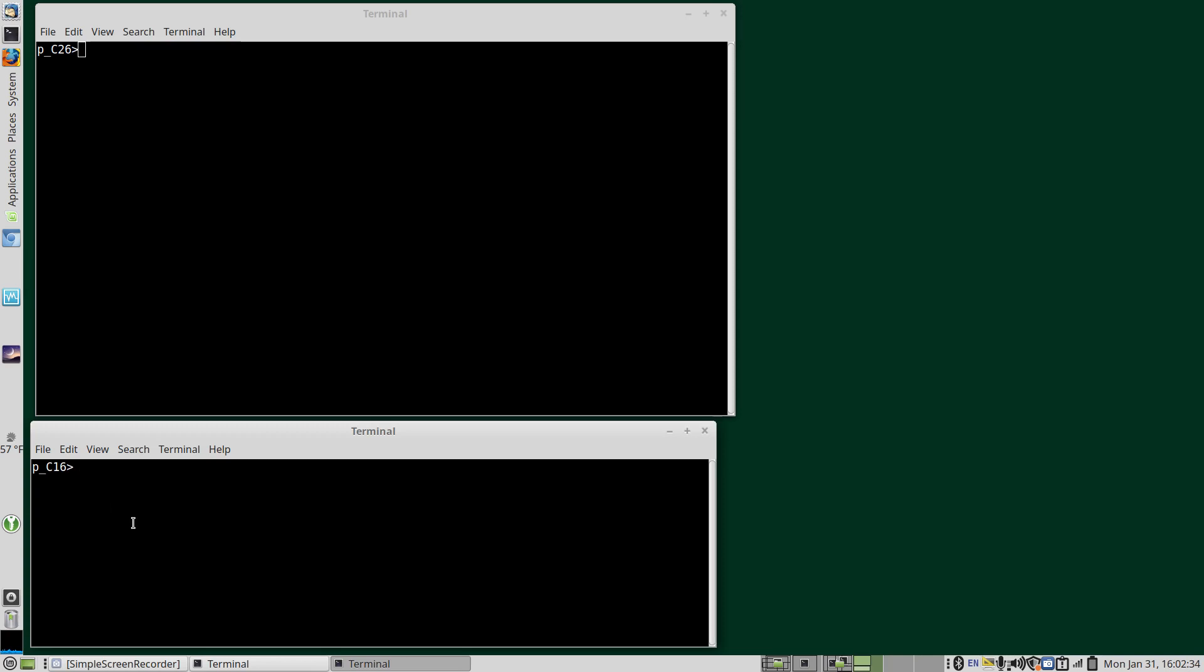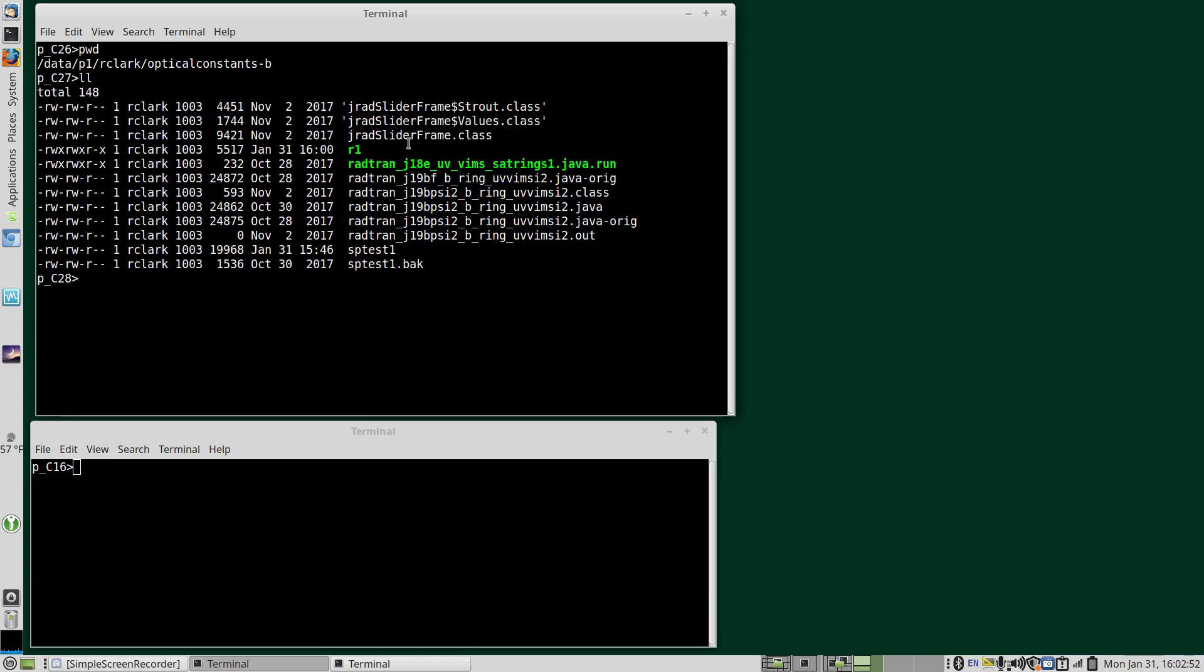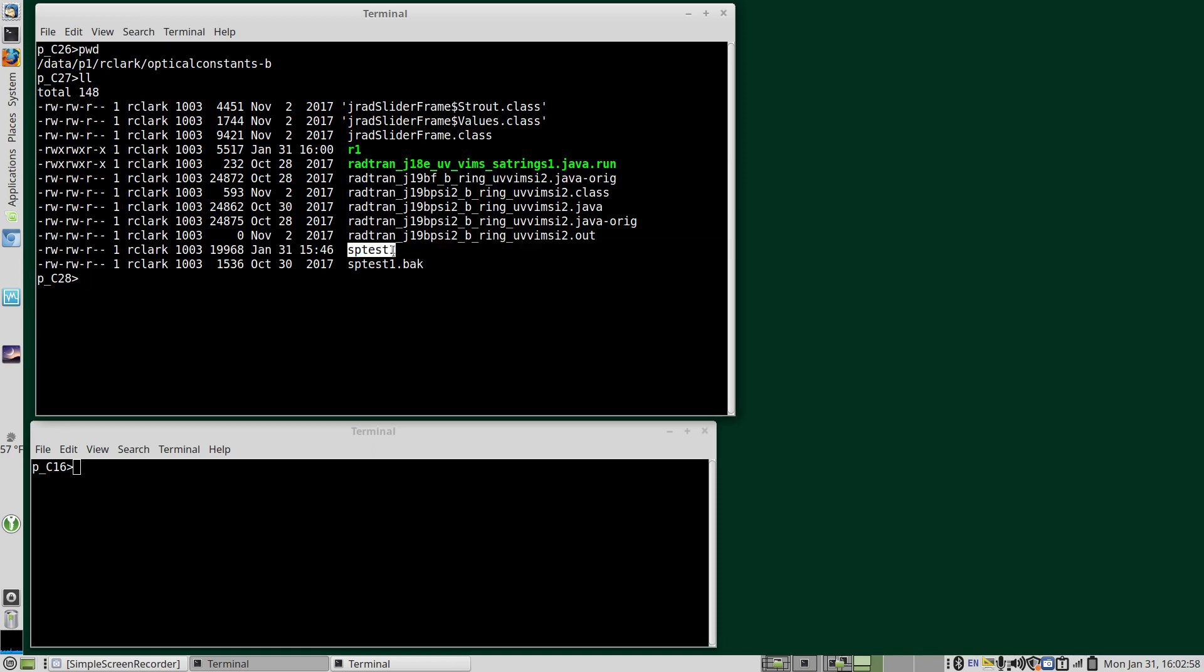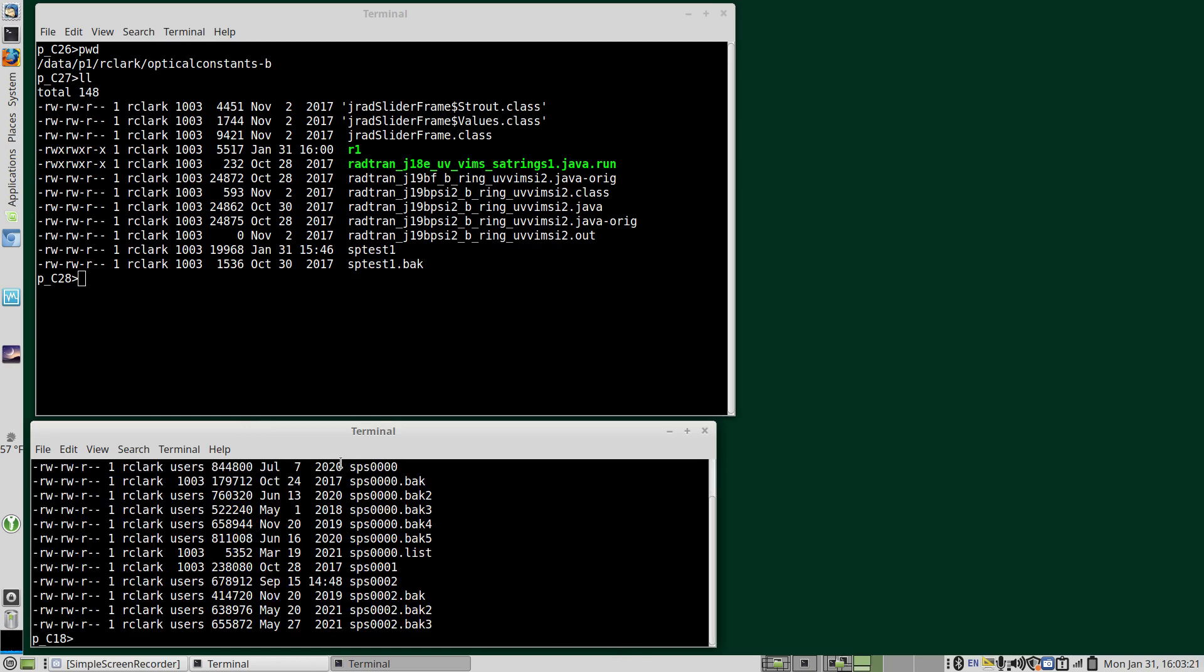I have two windows set up and I have very little screen real estate because I'm making this as a 1080p video. Normally I would use much larger windows. So I set up a directory that has a SPECPR restart file and a SPECPR file that I can write results to. I have another directory where I have my optical constants and some support files here.